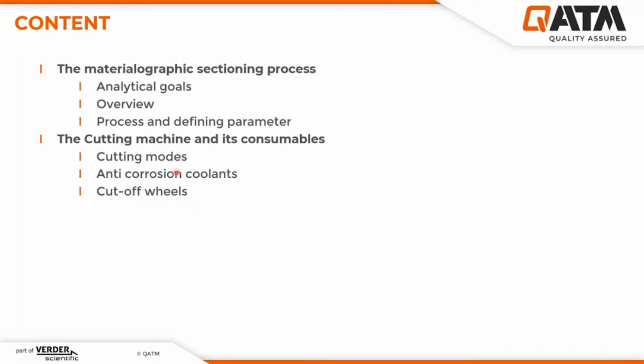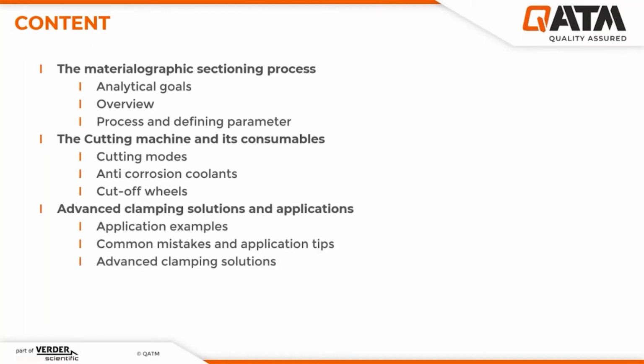I will elaborate differing cutting modes as well as give a short overview over the anti-corrosion coolants used as well as the cut-off wheels in application. Then the main focus of the webinar is reached.